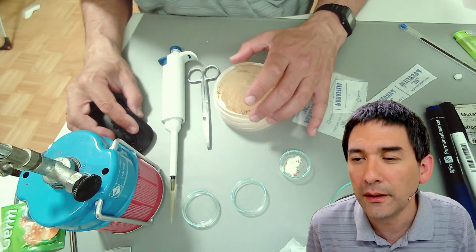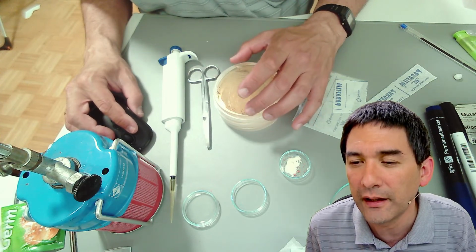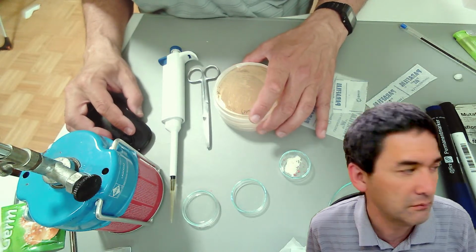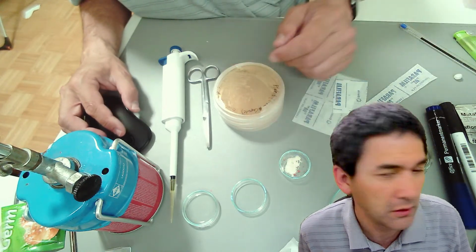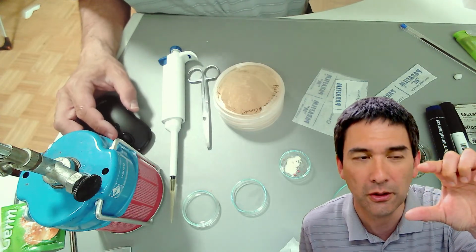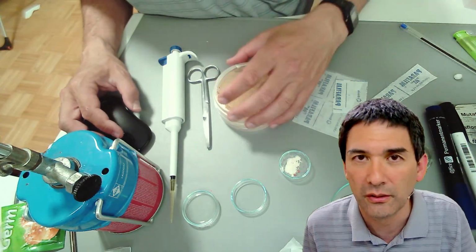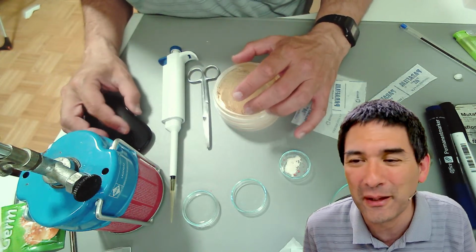Okay, thank you so much for all the information. There are lots of thank yous here right now. What's the largest objective you've ever seen? The largest microscope objective, sometimes it's not only the size, sometimes the diameter is quite large. I would say that the size also does not always tell something about the image quality.